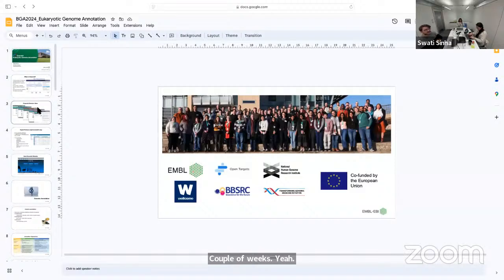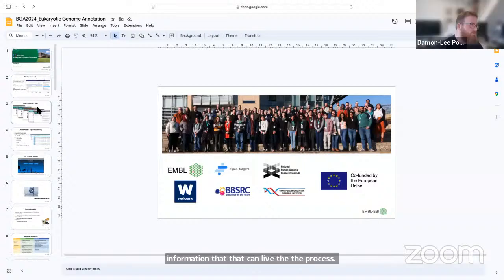If we are dealing with species that has, luckily for us, a lot of transcriptomic information, that can lengthen the process quite a bit. So you have to fall back on manually pushing things through the pipeline in the end, just because, well, I suppose you can't accommodate for all the variations in all the genomes. So that must be quite a pain in the backside.